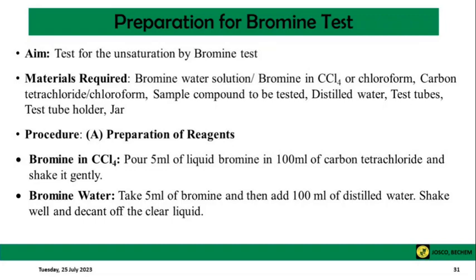Now, let us look at how we can prepare for our bromine test. Some of the materials that we would need are bromine water solution or bromine in chloroform. We would also need distilled water, test tubes, and a test tube holder. Remember that the materials you require would depend on the compound or sample you are working on, whether it is water soluble, water insoluble, or in gaseous form.